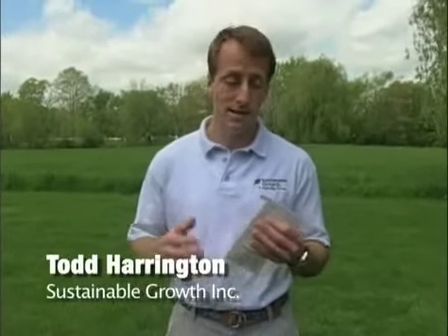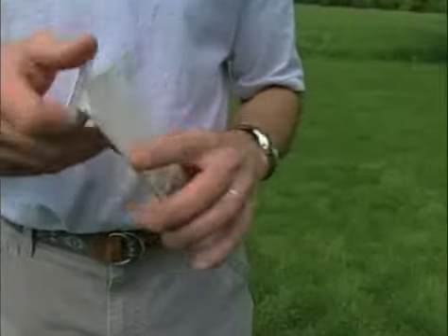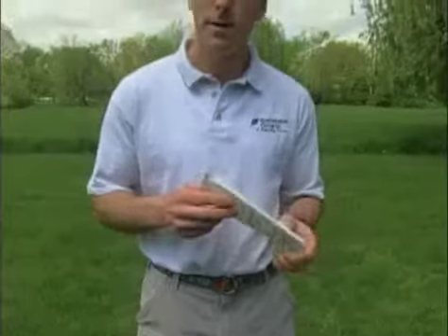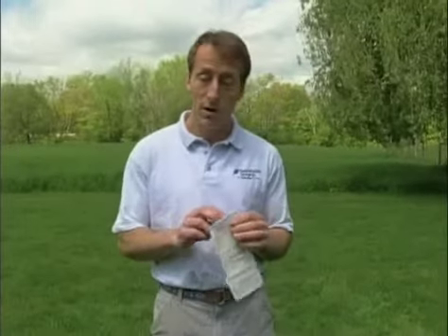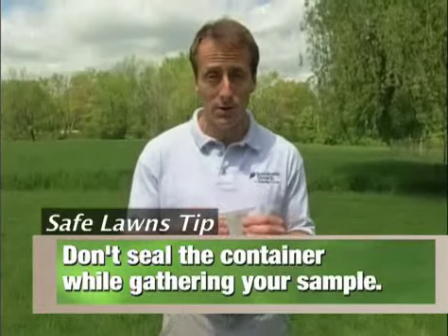The first thing you need is something to put your soil in. I happen to have a bag here that's actually lined with plastic. This is very important, especially if your soil is a little wet so it doesn't drip out of the bag. But any plastic bag will work. What's really important to note is that you want to make sure that you don't seal the bag, because if you do, you might change the chemistry of the soil test. So why don't we take a look at some soil and take some samples.